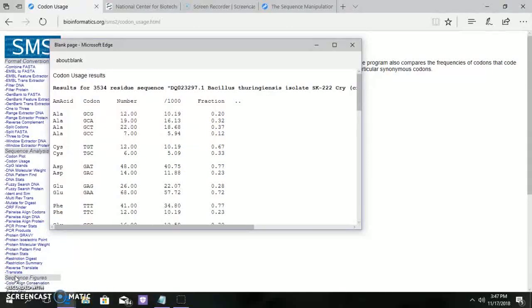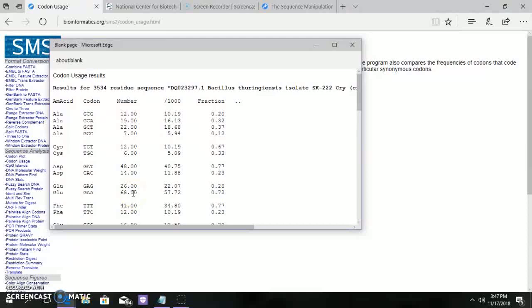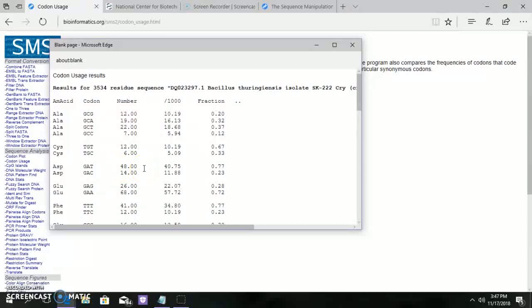From the result page, we can infer that glutamic acid is the amino acid which is dominant in the CRI gene, and the second dominant one is aspartic acid with 48 amino acids.